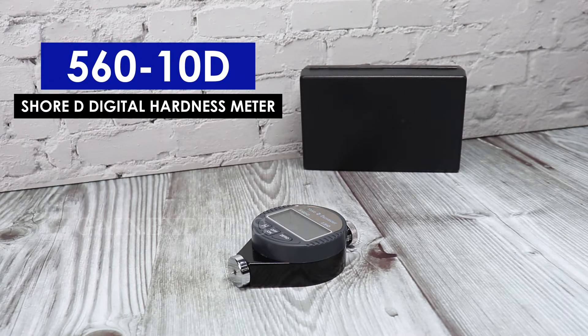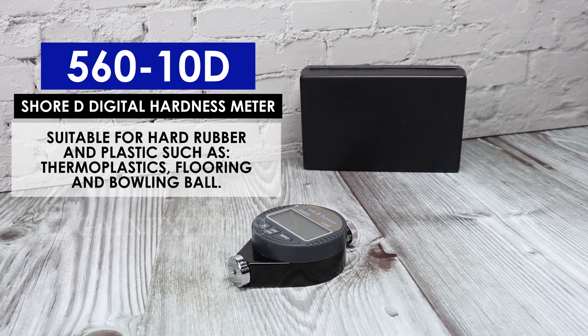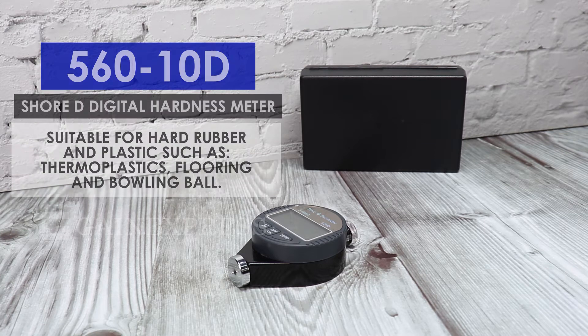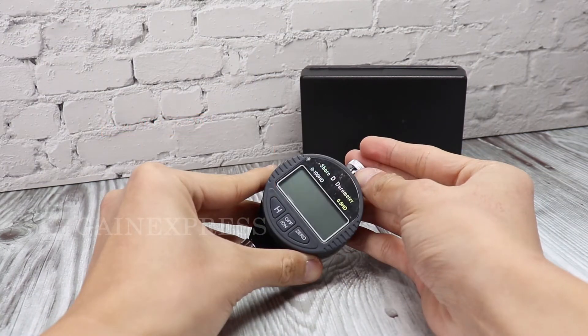56010d SureD Digital Hardness Meter. This meter is suitable for hard rubber and plastics such as thermoplastics, flooring, and bowling balls. Parts include the Hold button, On and Off button, Zero button, LCD display.